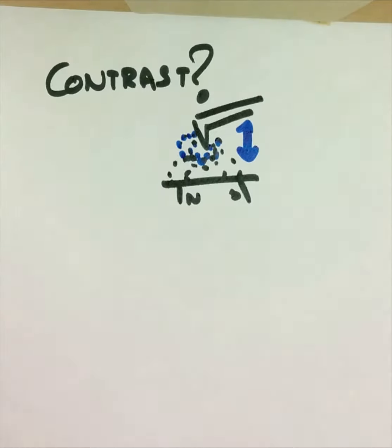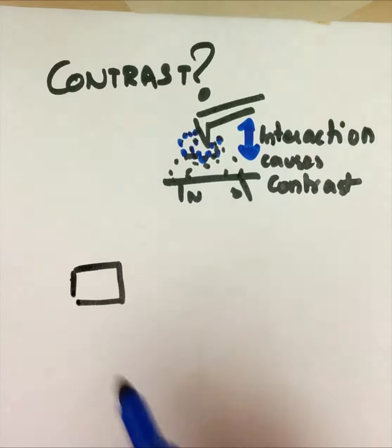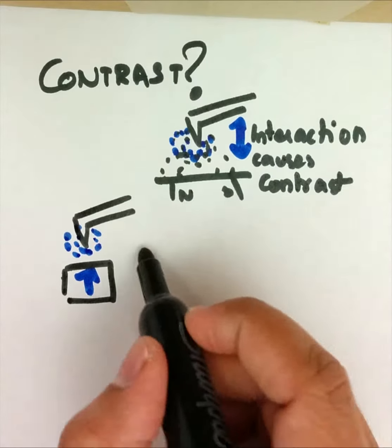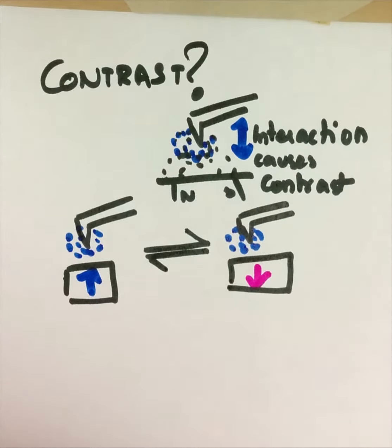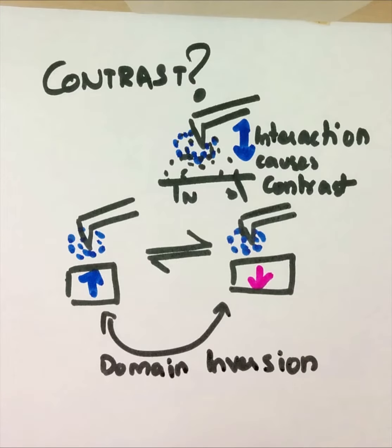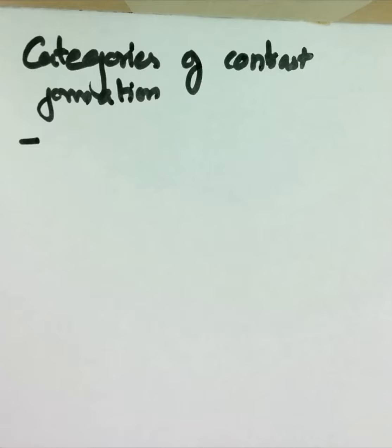The interaction between the magnetic tip and the stray magnetic field leads to contrast formation. Consider a domain aligned in this direction. Magnetic tip. The magnetic tip itself has a magnetic field around it. When the magnetic tip comes close to the domain, it is possible that the domain itself gets inverted. Thus, there could be a change in contrast within a single image. This is generally an artifact of MFM. As the tip passes through the sample, the tip sample position could vary. This variation would reflect in the makeup of the image.